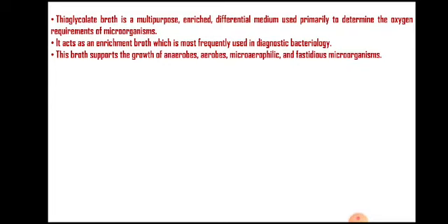These are the various categories, and the classification is based on the requirements of oxygen by particular microorganisms. It is an enrichment broth which is most frequently used in diagnostic microbiology or bacteriology. This broth supports the growth of anaerobes, aerobes, microaerophilic and fastidious microorganisms.